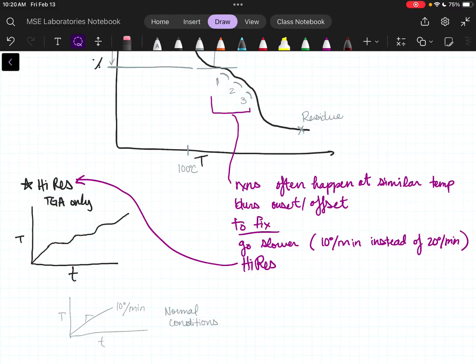Yep. But there are systems that can measure the gas coming off the back of that, so you can get yet a third line. It'd be like carbon coming off the furnace at any given time, and you could measure that along this axis as well. So lots of really cool things, and it's why there's a benefit to having this sideways setup.